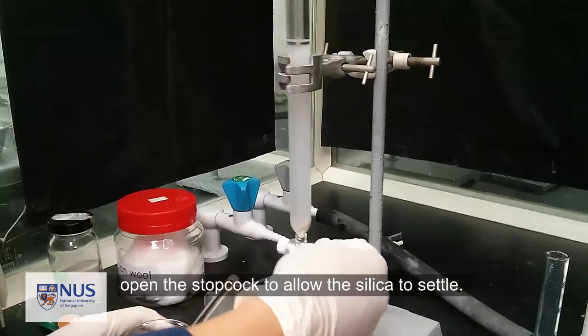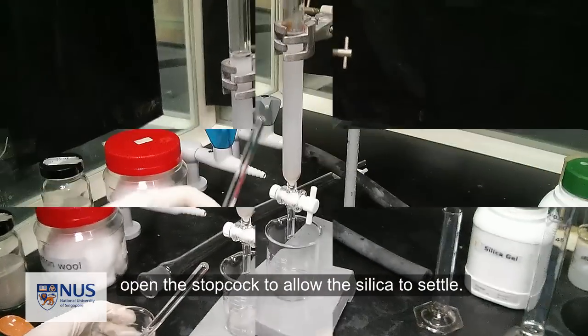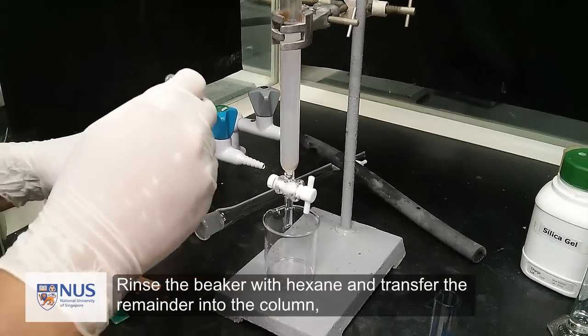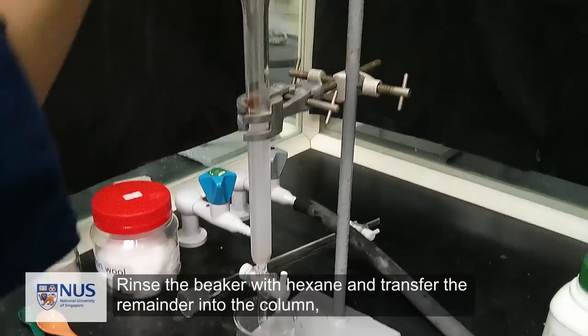Open the stopcock to allow the silica to settle. Rinse the beaker with hexane and transfer the remainder into the column.